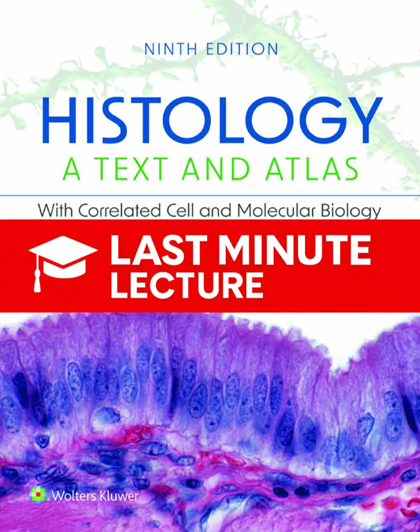So the real genius of the combined H&E stain is the incredible contrast it gives you. These dark blue nuclei against a pink background is why it's still the essential standard for seeing tissue architecture. So we've established that the standard formalin prep with all those organic solvents gets rid of neutral lipids. When does that actually matter, and what do you do when you really need to see fat in a tissue? It matters a lot. Anytime a pathologist is looking at, say, a fatty tumor or any tissue that's rich in triglycerides, to keep those neutral lipids, you have to skip the organic solvent step completely.